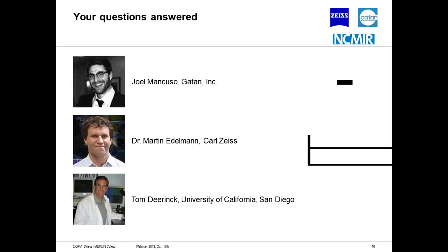Tom, a next question again for you, I think. Do you have any ideas to adapt the improved heavy metal staining for serial blockface imaging for freeze substitution? Yes, this is actually something that I think the community would like, and we are working very diligently on to bring this technology to high-pressure frozen material. And there are some challenges, but we are making progress, and we do believe we will be able to show something, I think, probably at the next Microscopy and Microanalysis meeting next summer. We'll be able to show it publicly. But yes, there's a lot of effort in this direction.